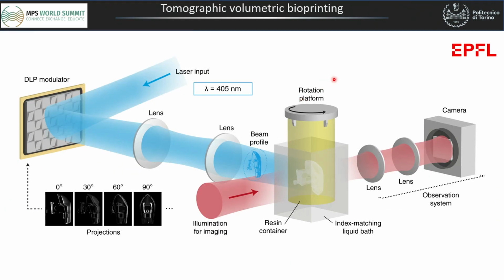In this work, we used tomographic volumetric bioprinting to reproduce such a glandular shape. This technique consists in illuminating a cell-laden photosensitive hydrogel with visible light, using a sequence of tomographic back projections of the desired object, leading to the photopolymerization of the material.